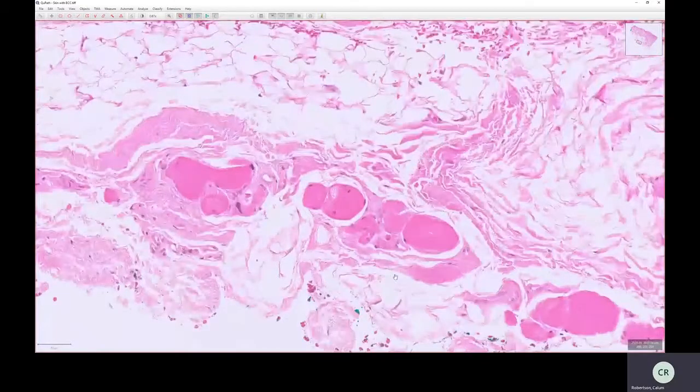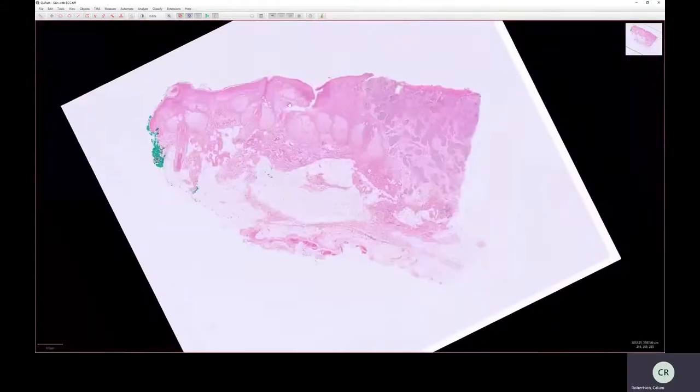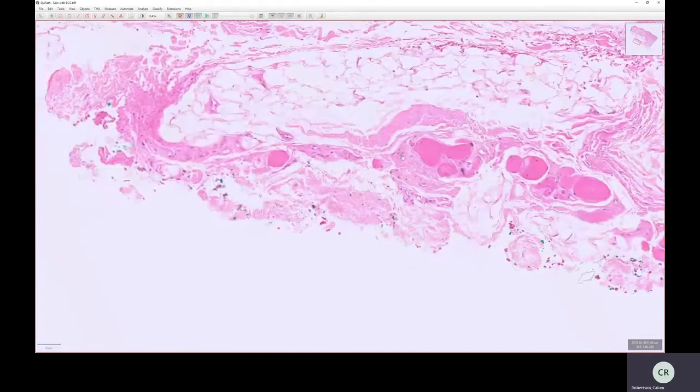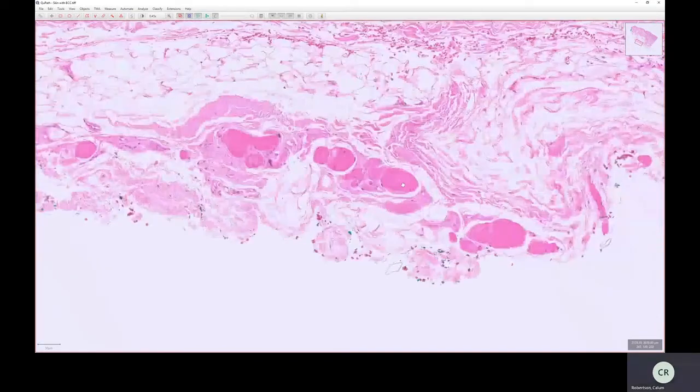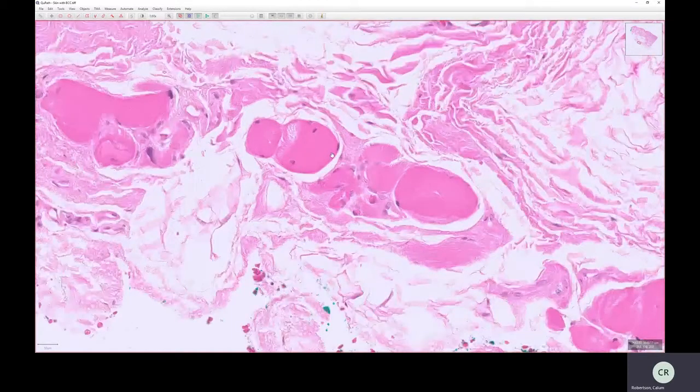Okay, so this is the other main type of muscle called skeletal muscle or striated muscle. So here we're in the face. This is skin of the face. So we've got the epidermis up here, and this is the dermis, this is the subcutaneous fat, and underneath that we've got a bit of skeletal muscle, which might be facial skeletal muscle that's responsible for facial expressions, etc. So we've got just a few cells here, skeletal muscle, but it illustrates quite nicely the main points.